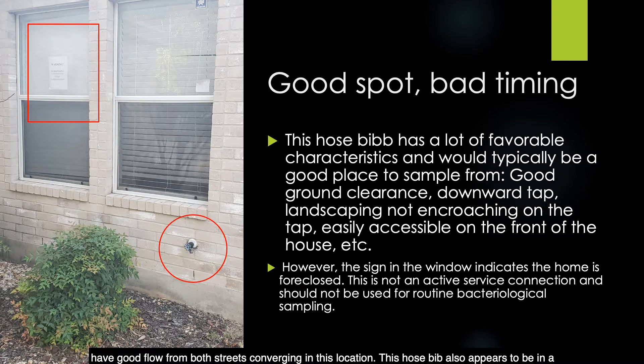This hose bib also appears to be in a good location with favorable characteristics — good ground clearance, a downward facing tap, landscaping not encroaching, and easily accessible. However, the timing is not the best. If you look at the sign in the window indicated in the red rectangle in the top left corner, this home is foreclosed. It is not an active service connection and should not be used for routine bacteriological sampling. It's best to choose an alternative site from your sample siting plan.